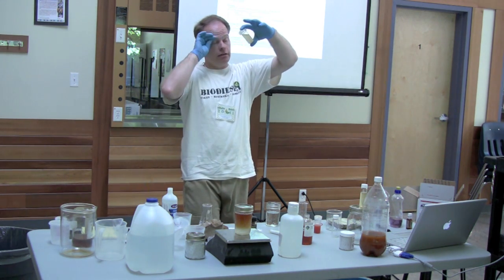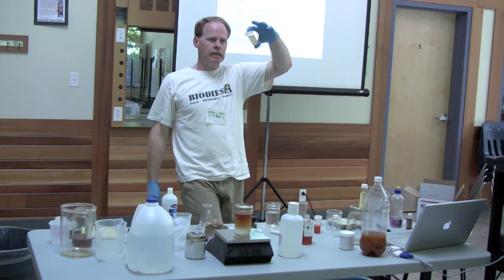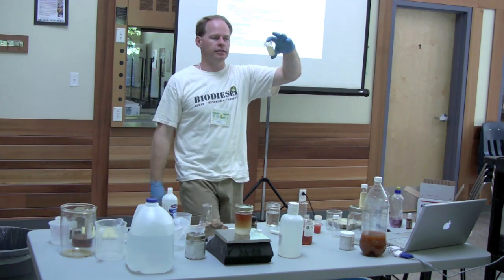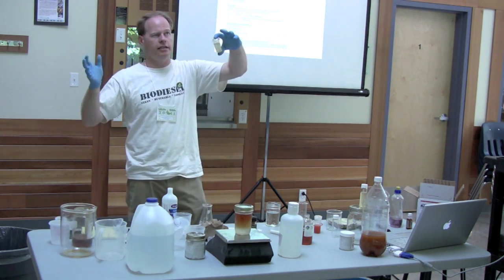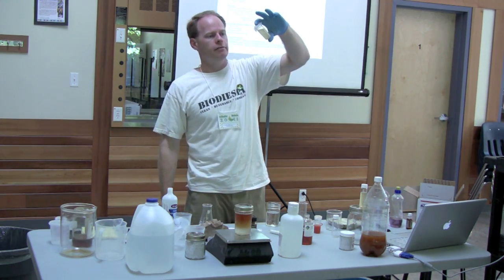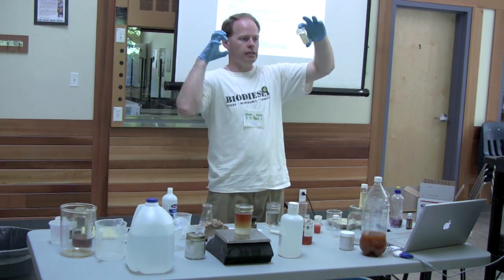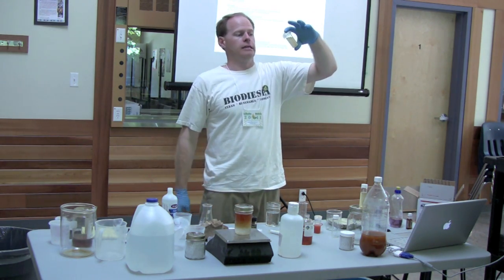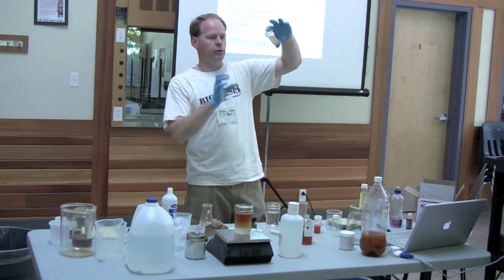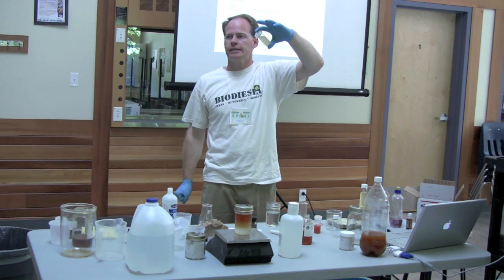If there's 1/8 of an inch to 1/4 of an inch, depending on what diesel I'm going to put it in, I might do it again. If it's going in a Mercedes, I don't care. It's going to eat it. Like the older '80 to '87-ish model, it's going to eat it because it'll eat vegetable oil. Volkswagen, the older ones, I don't care. Duramax, I care because that one's a lot more sensitive engine. A Ford 6 liter, I preferably wouldn't even want to be putting biodiesel in, but if you are, and you flunk this bad, you definitely should re-react.